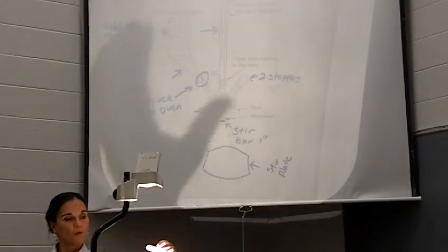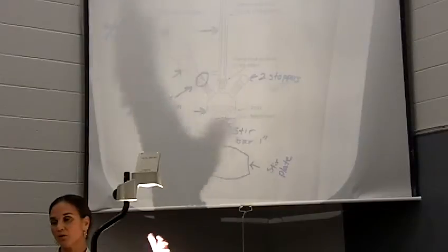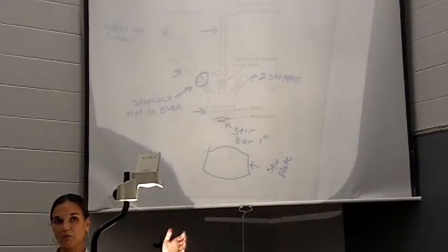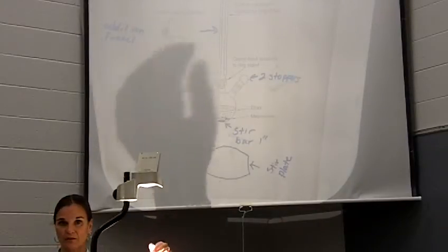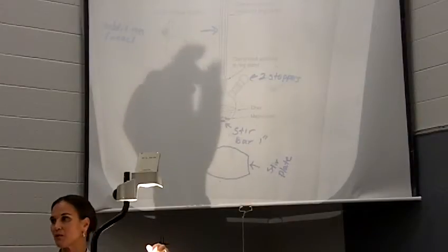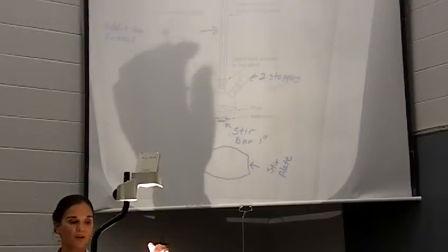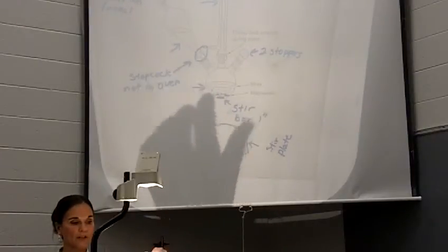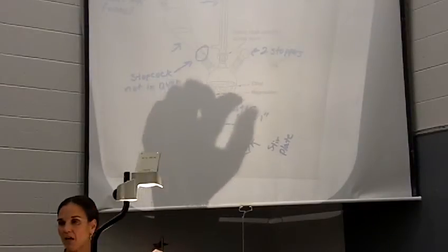Now, when you go to get your glassware out of the oven, it's really important. You're using ether, okay? And we've talked about the boiling point is 34 degrees. So you have to let this glassware cool to room temperature before you introduce any ether into it, okay? Otherwise, if it's not at room temperature, you're going to immediately start boiling your ether, which you don't want to do.